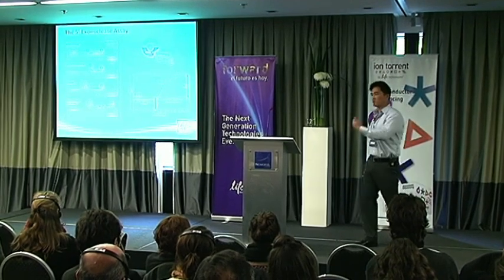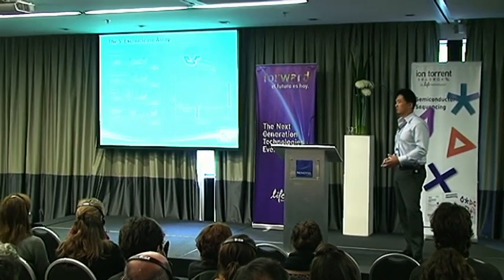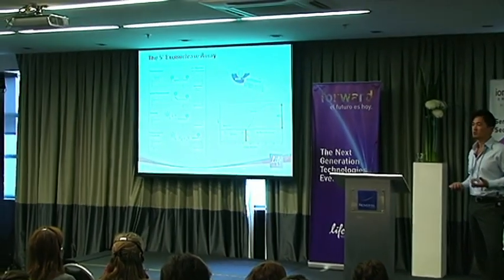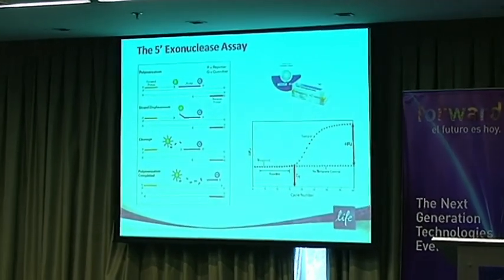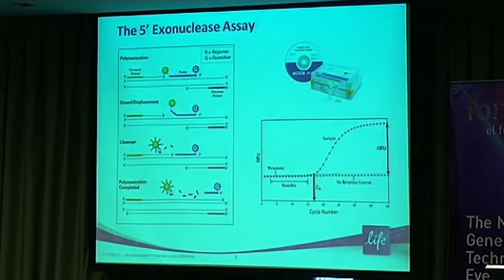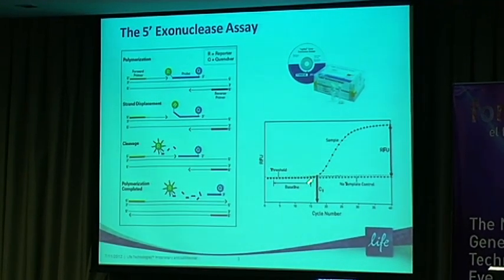So at every PCR cycle, we're doubling the amount of fluorescent molecules that are in solution, and so we're getting an increase. We get this sigmoidal increase as we go through PCR cycles. And so, of course, the data that we collect then is at this point right here. You just draw a threshold. And that's basically how it works.